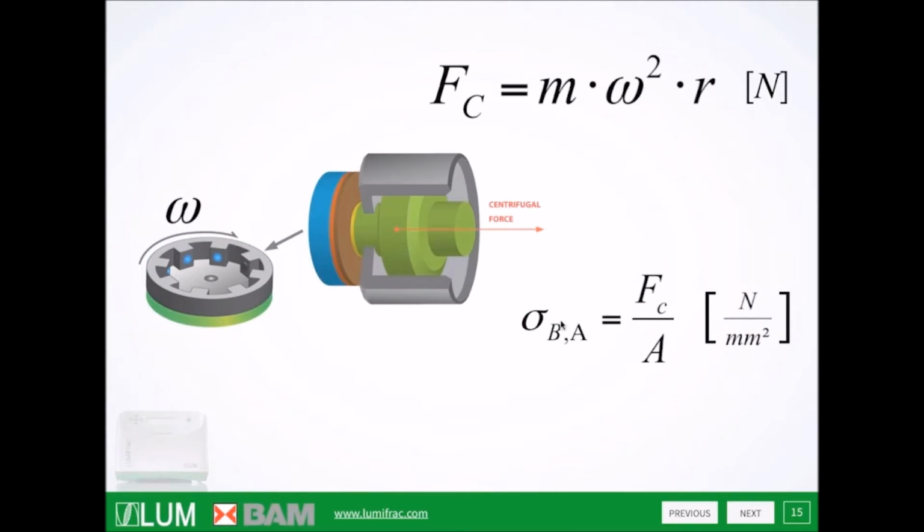Here you have the assembly again, and once it is put together you put it into the rotor. You can put in 8 different samples and you start the centrifuge. Of course, as it starts to turn, you have an angular velocity.